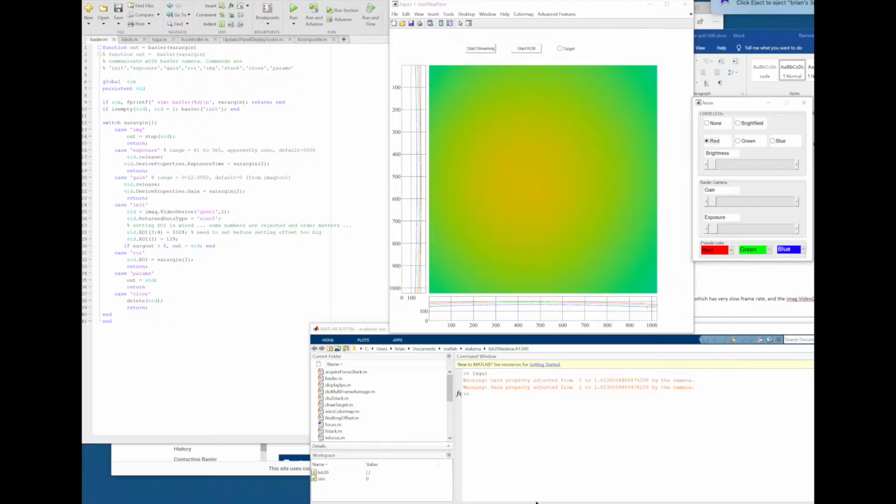Here's what it looks like from the top. I've replaced the sample with an out-of-focus business card for the purpose of looking at optical alignment. And here, the first screen, or first image, you can see a little bit of the curvature that we expect, and clearly some off alignment. I've added a target which only shows up as we start streaming, and for that we need to have a little bit of LED.